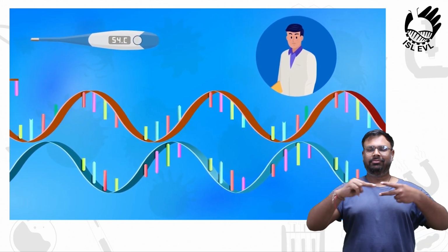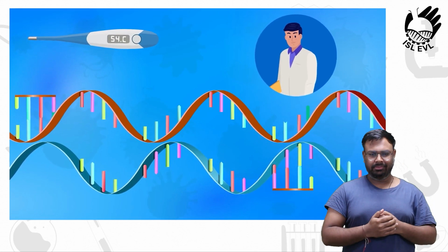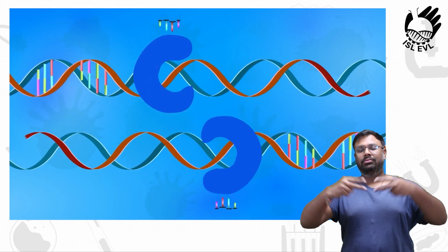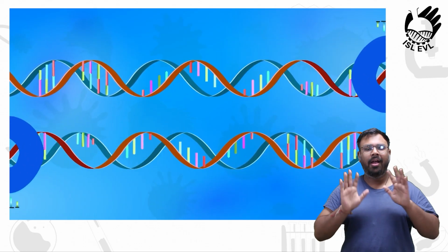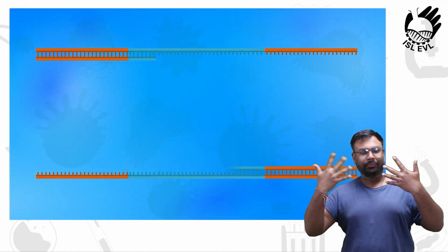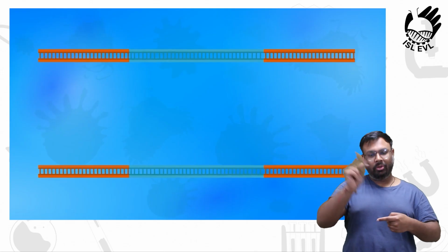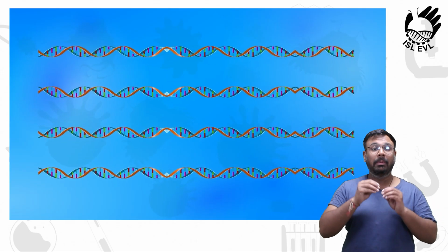Here the primers, which are short polynucleotides, attach themselves to DNA strands that can act as a starting code of DNA synthesis, and with the help of polymerase enzyme, new nucleotides will be added to the DNA strands. Finally comes the extension stage, where polymerase enzyme adds new nucleotides to both the strands to produce complementary strand. Thus, we went from having 2 DNA strands to 1 billion copies in 30 cycles.